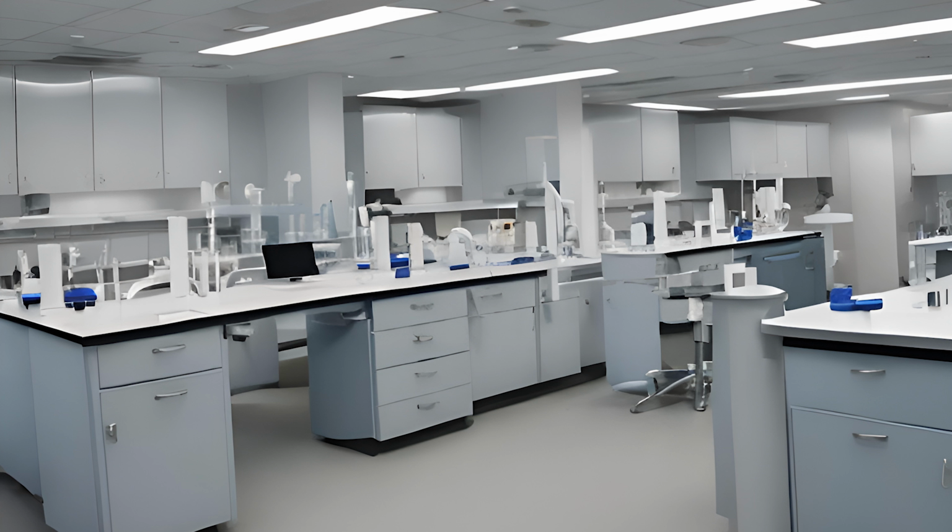When implementing this plan, each lab employee is going to be placed in one of three groups. You have Group 1, which is all of your employees that have occupational exposure to blood or other potentially infectious materials. This is basically everybody in your lab who is doing actual hands-on scientific work. If you are working with body fluids, you are working with biohazard, you're going to be in this group. The majority of people are. Then you have Group 2, which are some employees have occupational exposure to blood or other potentially infectious materials. Then you have Group 3. No employees have occupational exposure to blood or other potentially infectious materials.